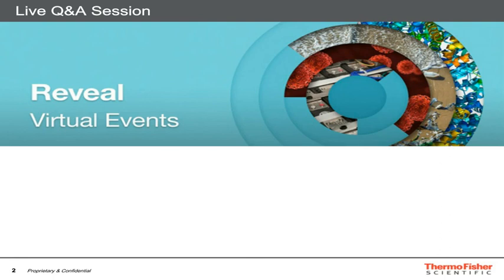I'm not quite sure what you mean by changes. Can it affect the results of valence band spectra? So two things I'll answer. One, of course, if you have a stack of films and you depth profile through the stack, then yes, of course the valence band spectrum will change as you profile through different materials. And that can be very helpful.